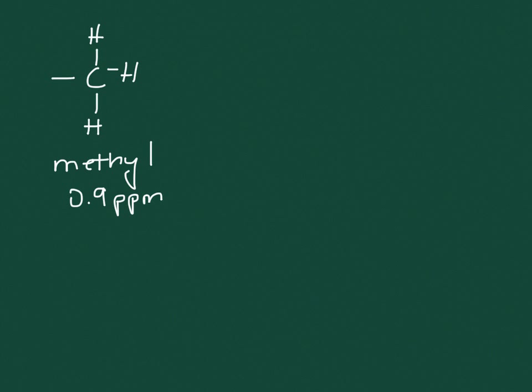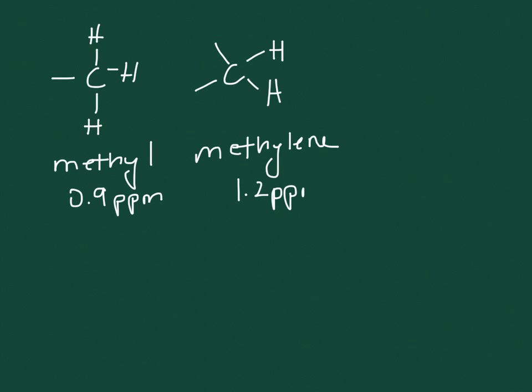So I stated in the previous lecture that I would like you to be able to draw an NMR spectrum based upon a given chemical structure. So if we commit a few numbers to memory, it is possible to predict the chemical shifts for protons in a variety of compounds. These are coming from your book. So for methyl hydrogens, 0.9 ppm. For methylene, it's 1.2 ppm. And for methine, it's 1.7 ppm.